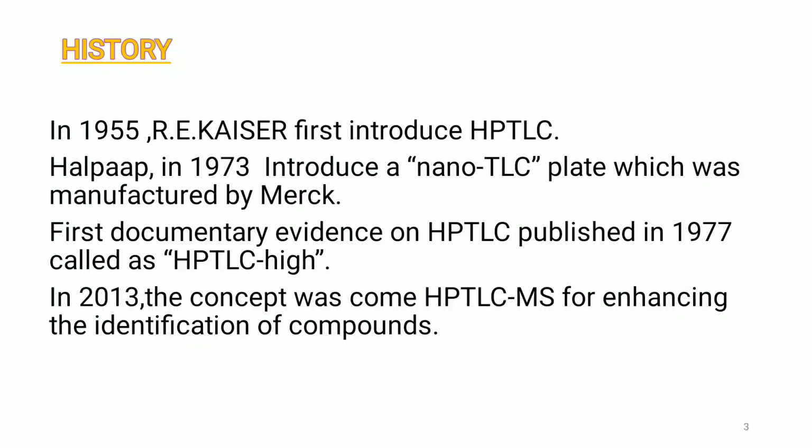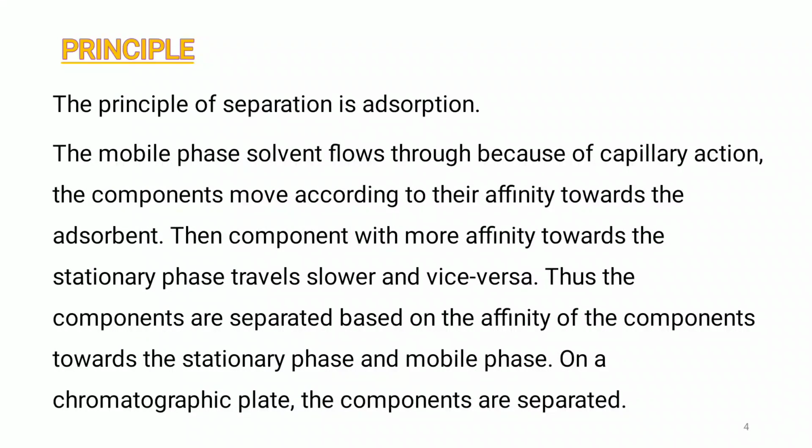On the next slide, we discuss the principle behind HPTLC and how the components are separated by HPTLC. As you know, it is an automated and sophisticated form of TLC, so the principle remains the same as TLC. The principle of separation is adsorption.